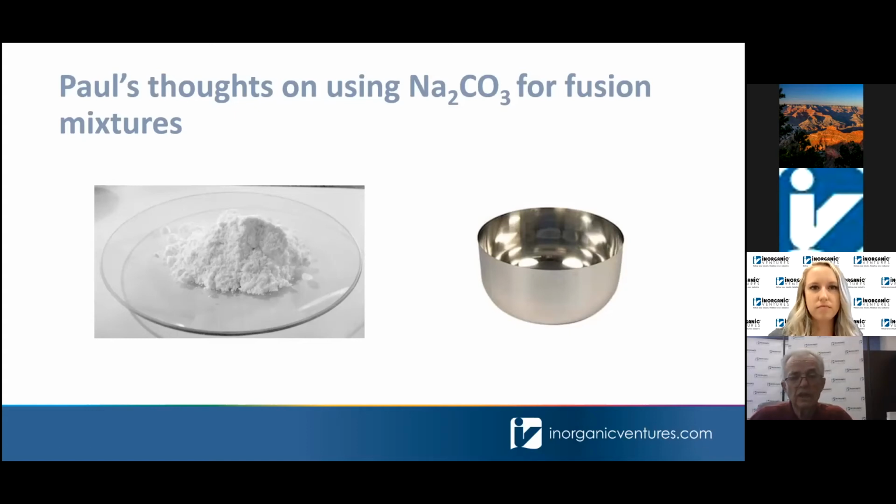It's very easy to get in solution, just adding dilute hydrochloric acid. In the case of tin, I would recommend usually about a 6-to-1 molar ratio of fluoride to the metal expected content. You don't need excess in order to stabilize your tin.